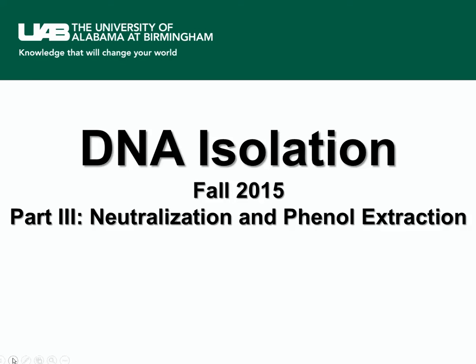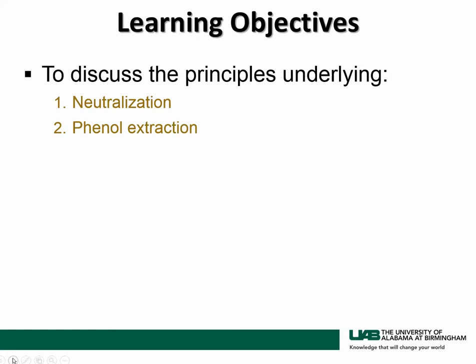Again, we continue our lecture on DNA isolation, and we come to part 3. In this section, we're going to deal with neutralization and phenol extraction. So the learning objectives for this section number 3 is we're going to discuss the principles that underlie the process of neutralization and the process of phenol extraction.